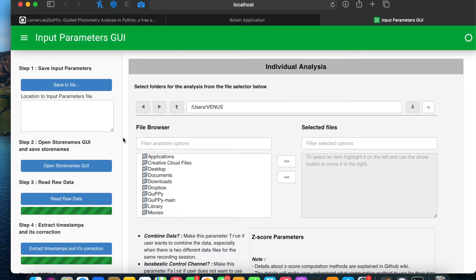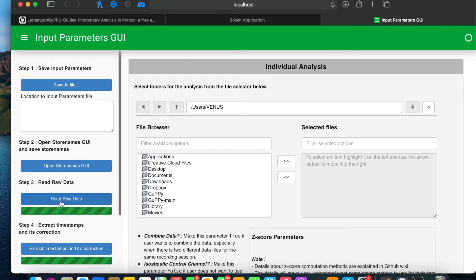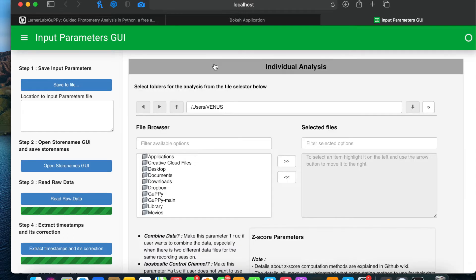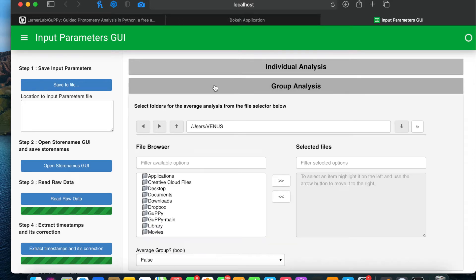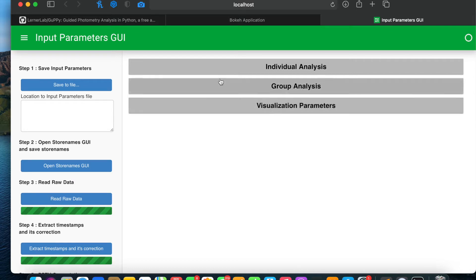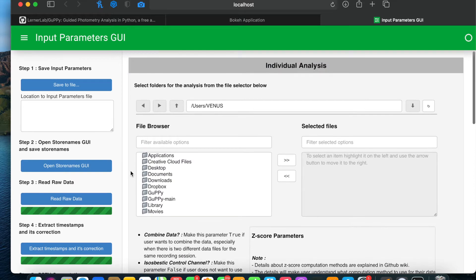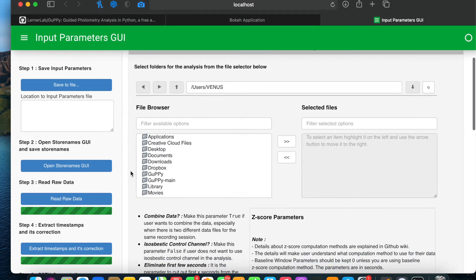So Guppy home page looks like this. These are all the steps which we do in the analysis process. There are three different sections containing different parameters: one is the individual analysis parameter section, the group analysis parameter section, and visualization parameters. I am going to explain all these parameters. Keep in mind that these parameters are also explained on the GitHub wiki page.